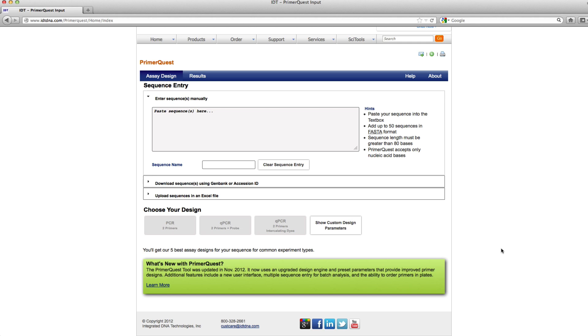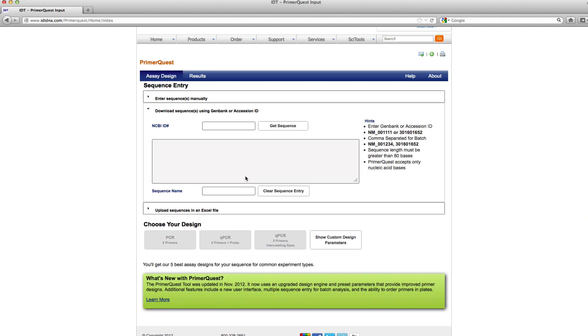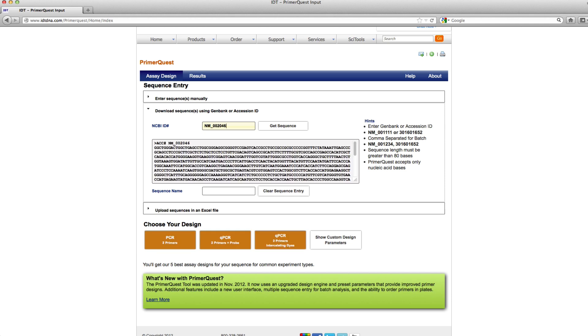The example I'm going to show you is with a human GAPDH sequence. I'm just going to go ahead and type in the accession number for this sequence. I just clicked enter to get the sequence to populate in this sequence box. I could also click get sequence if I wanted to.